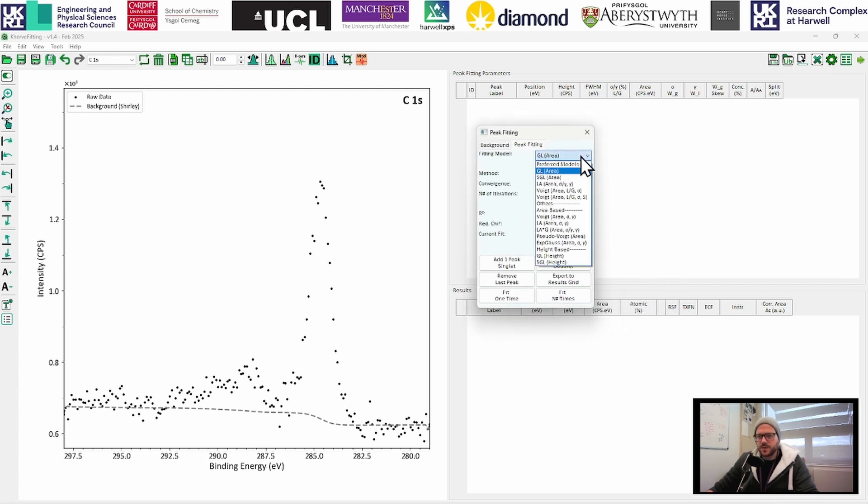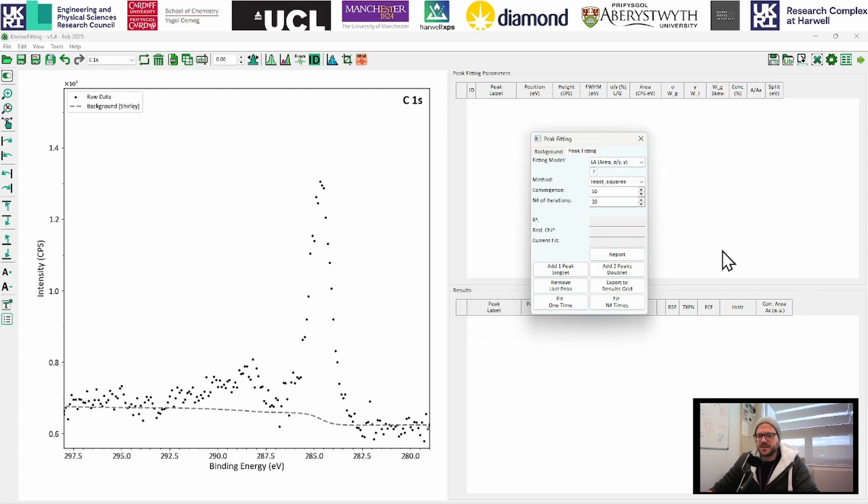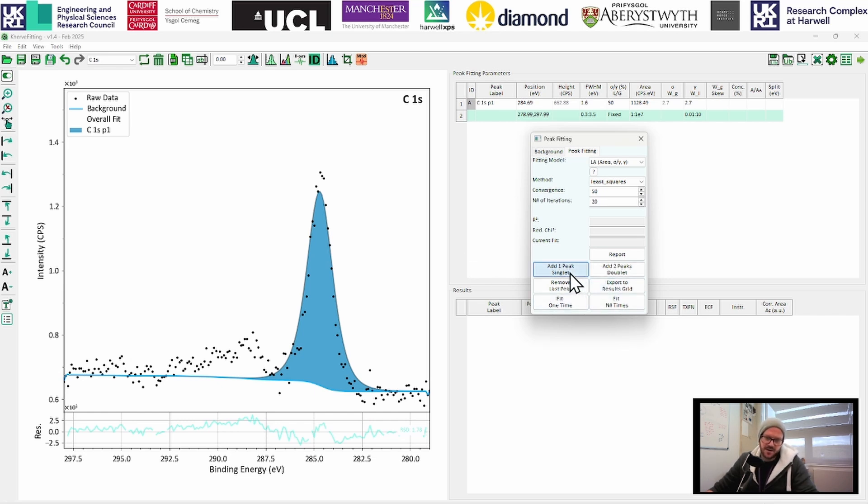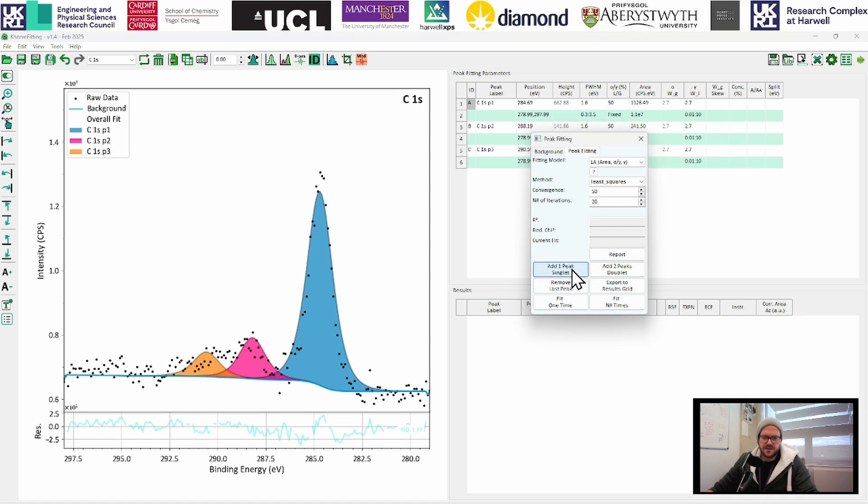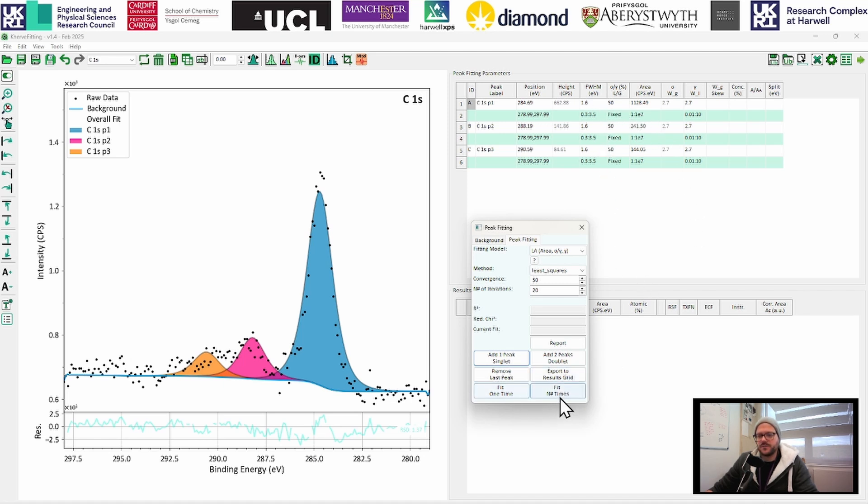So now we're going to head into peak fitting. So we have a few different models that we can choose from. I'm just going to go to an LA type peak. And we're going to start, we're just going to add a single peak. And there's going to be our CCCH peak. And we can probably add in another one somewhere over here. And another one, yeah, probably about there.